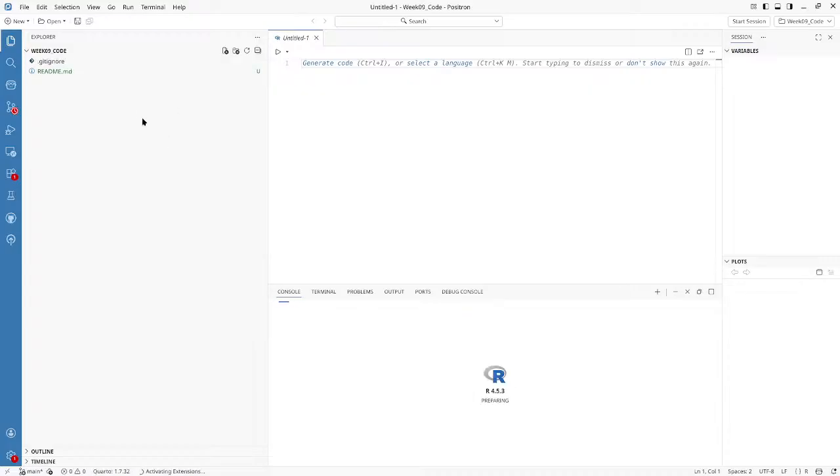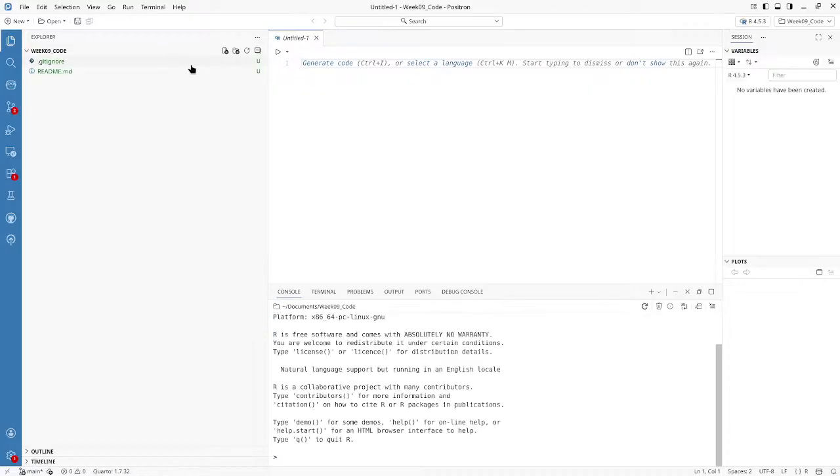So now that we're within our new project repository, we can just do some of those organization things we saw during the pre-course walkthrough, just to make our lives a little bit easier. I will often just go ahead and create data. I'll create an images folder, and as you can see, it'll just default output to here. So I'm just going to copy and drag it down, so I have two separate folders.